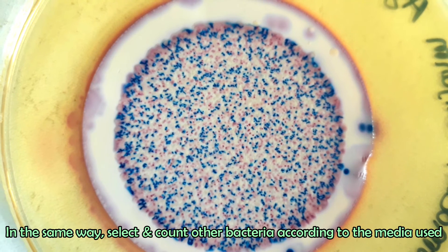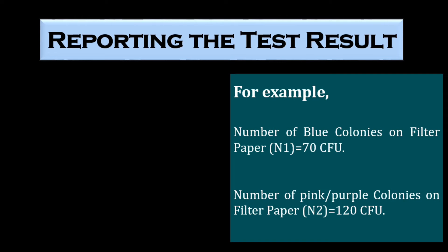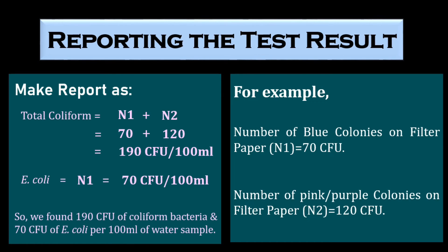In the same way, select and count other bacteria according to the media used if you test your sample for other microorganisms. Now we will make a report of our test result. For example, we found 70 blue colonies and 120 pink or purple colonies on the filter paper. Total coliform is the total number of blue and pink colonies, which is 190 colony forming units per 100 ml. Total E. coli is only the number of blue colonies, which is 70 colony forming units per 100 ml.